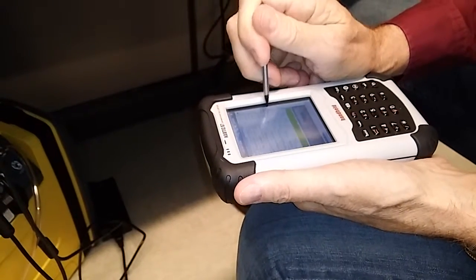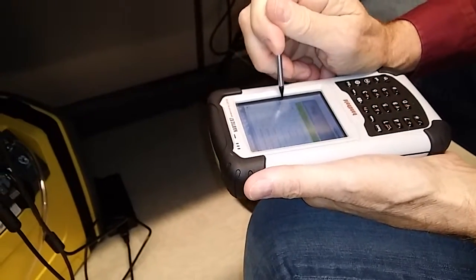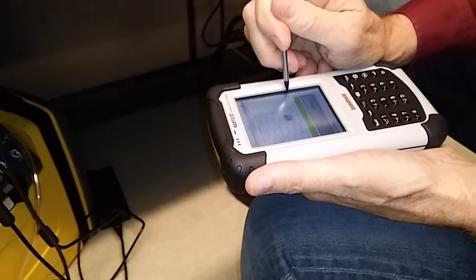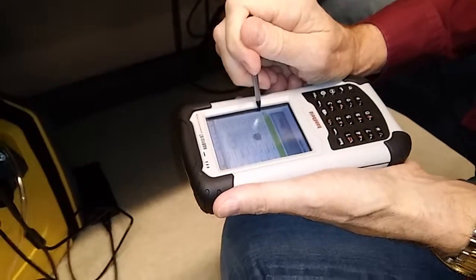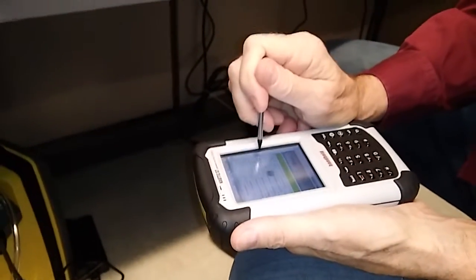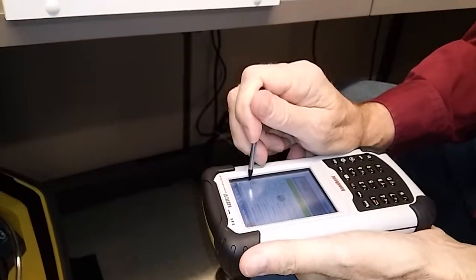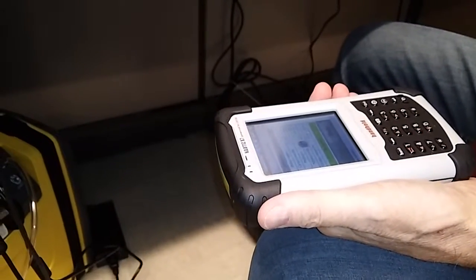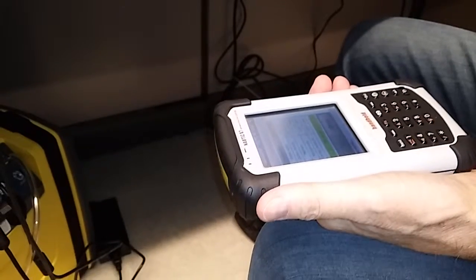Again, you can see the changes. It's basically back down to 0, but ethylene is still up there. Toluene. Anyway. Now we're up to 500. Carbon dioxide, we're breathing too heavy.